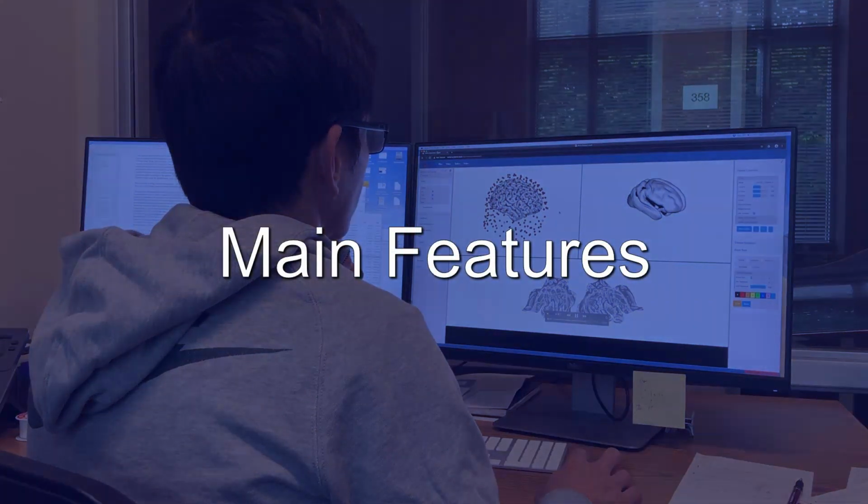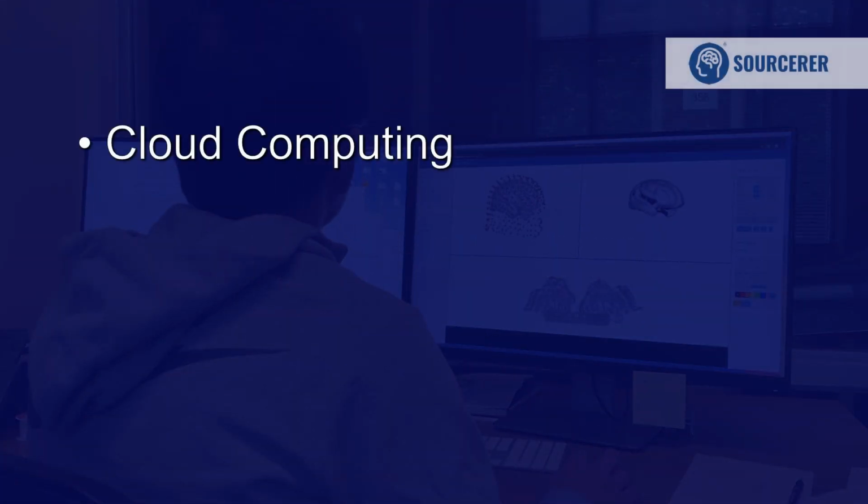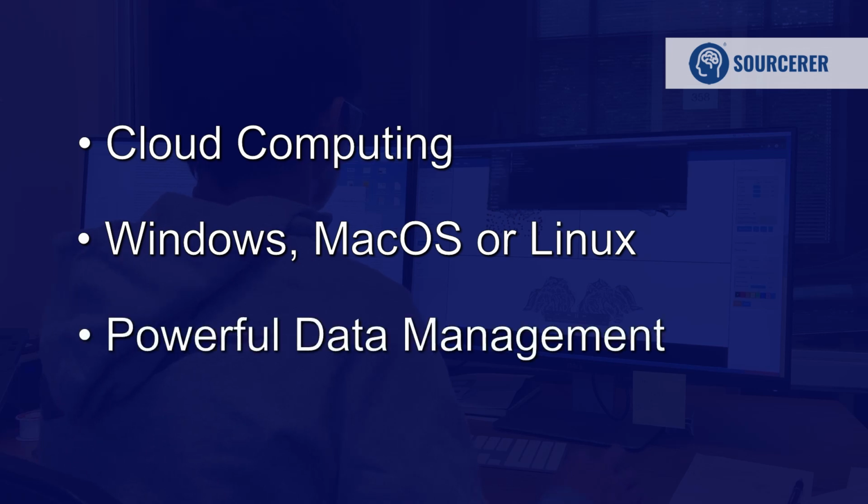We can quickly go through some of the main features of Sourcerer. Sourcerer uses cloud computing, can be run on any computer operating the Chrome web browser, and it's not operating system dependent. Powerful data management and data exchange are included in the web-based interface.